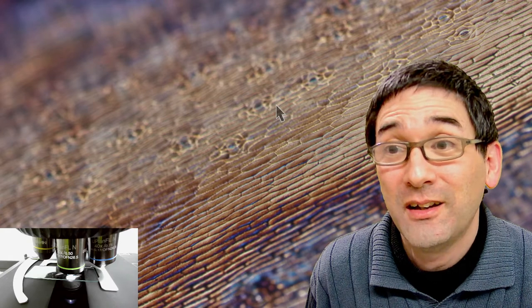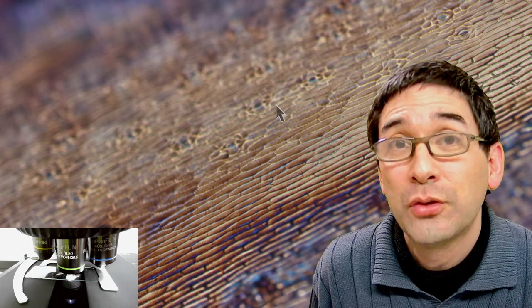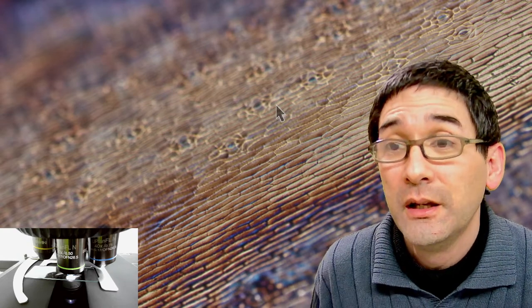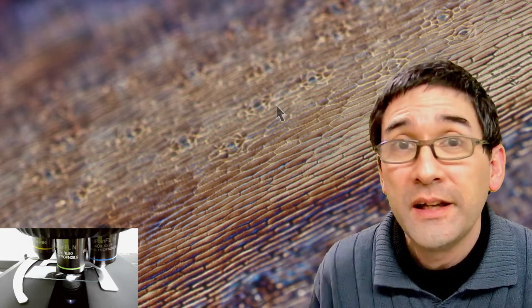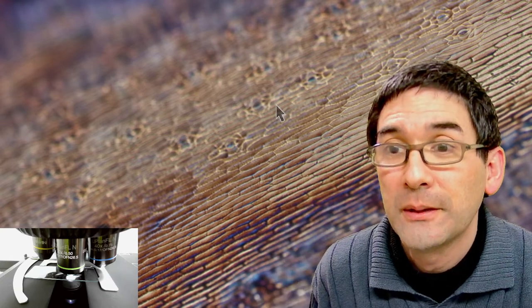If you want a source of safe live bacteria, I recommend buying yourself some yogurt cultures, which can be bought on Amazon. There are even capsules for eating which contain bacteria to regenerate the digestive system — those are safe bacteria. Can I get microbes from soil? Of course — that's actually a nice idea. The difficulty is that soil particles might cover up a lot, so it might be difficult to find them. You need a system to filter away the larger soil particles.